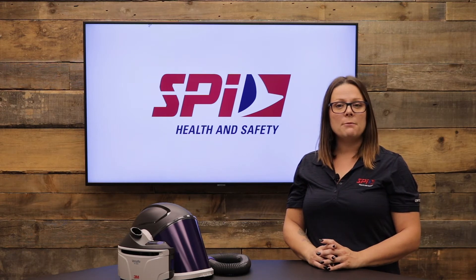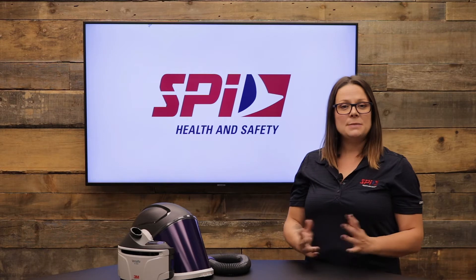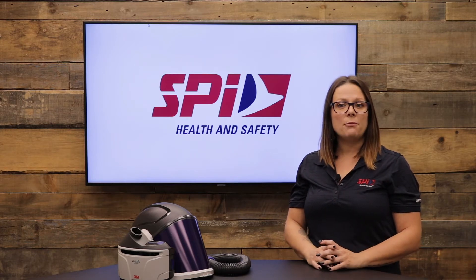Let me introduce you to the 3M Versaflow PAPR TR300 Plus system. It's been re-engineered to deliver enhanced comfort, usability and versatility.